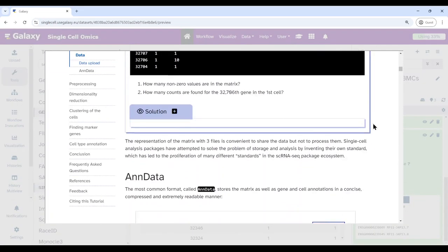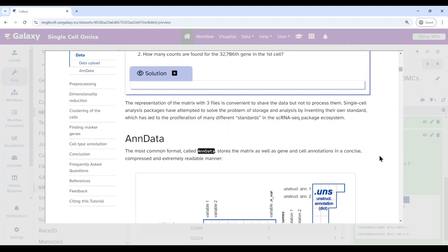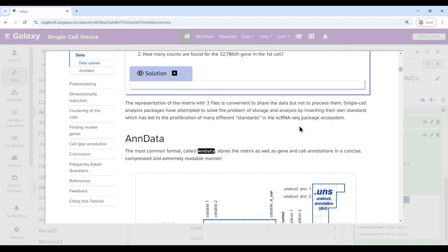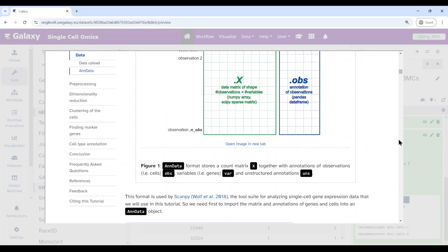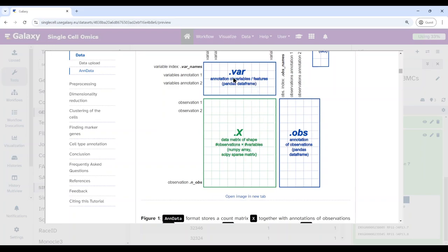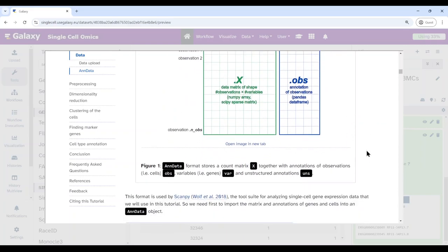Now we look at a way to store all three files together, using a format called AnnData. AnnData is the most popular format in single cell data analysis, especially when working with the ScanPy tool suite. It's a binary format that stores all three files together in one single object — it contains the count matrix, the annotation of variables (which are the genes), and the annotation of observations (which are the cells). This is what we are going to use throughout this tutorial, as input and output for most tools.